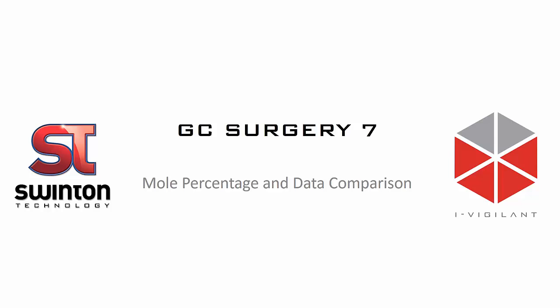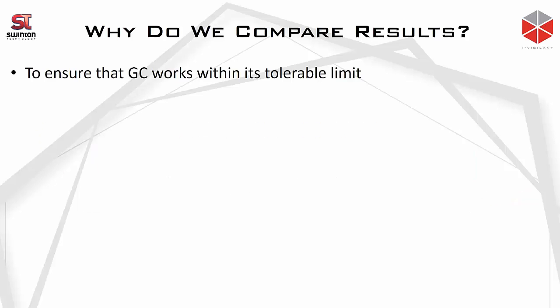Hi everybody, this is the recorded version of GC Surgery Session 7 about mole percentage and data comparison. What we're going to talk about here is how we actually get the mole composition data and compare it between GCs, between the mole composition of one GC against its multi-level calibration composition, comparing it against the spot sample, etc. So to begin with, the question is, why do we do a comparison of the data?